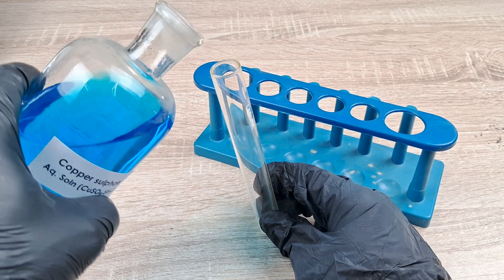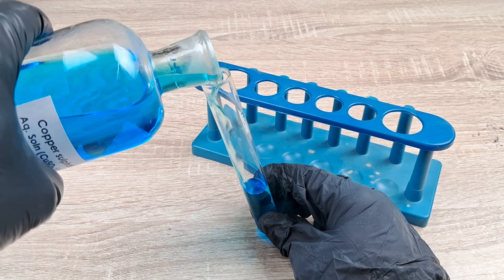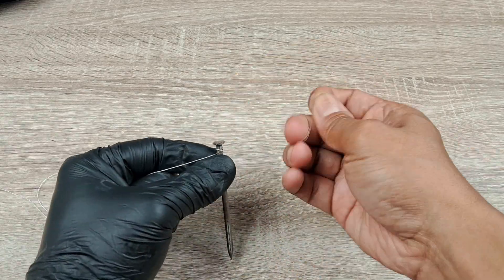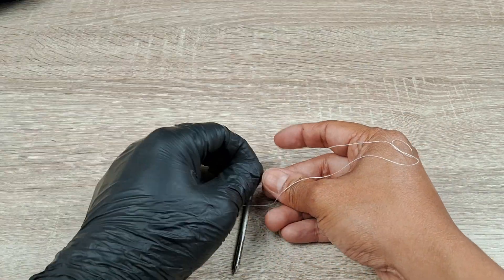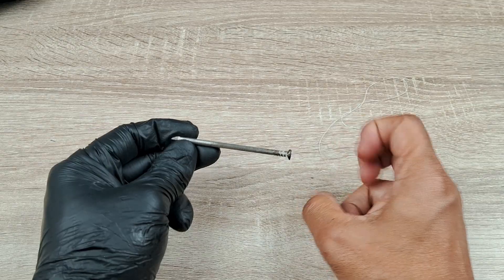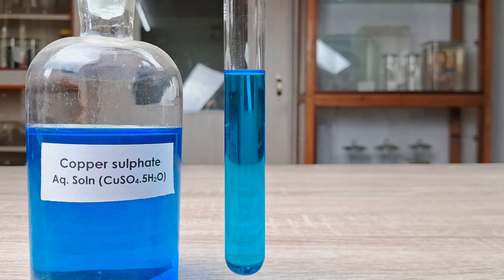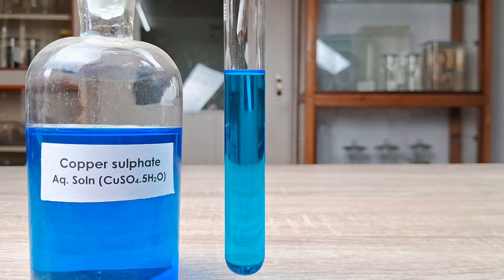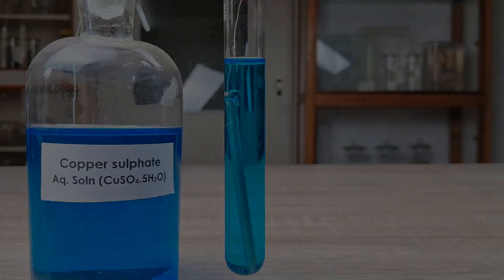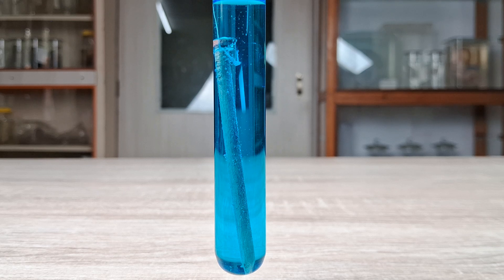Procedure: Fill about half of the test tube with copper sulfate solution and note the color of the solution. Tie the iron nail on one end using a length of thread and note the color of the iron nail. Then introduce the iron nail carefully into the copper sulfate solution. Watch closely and record your observations.